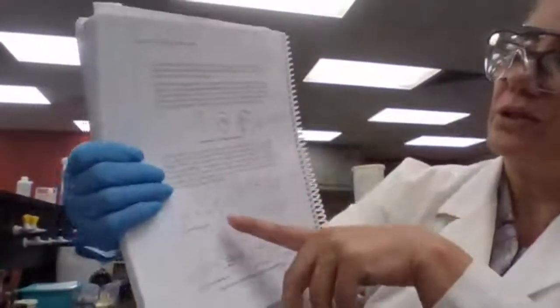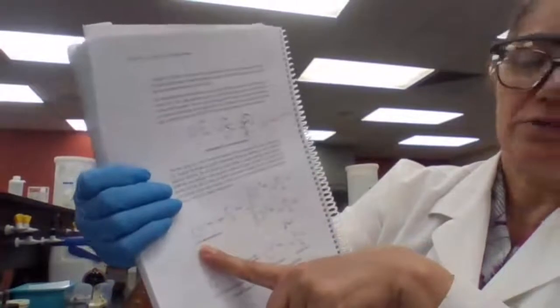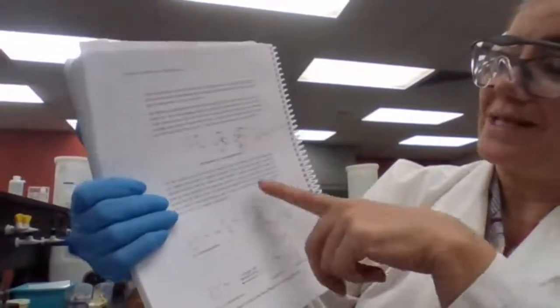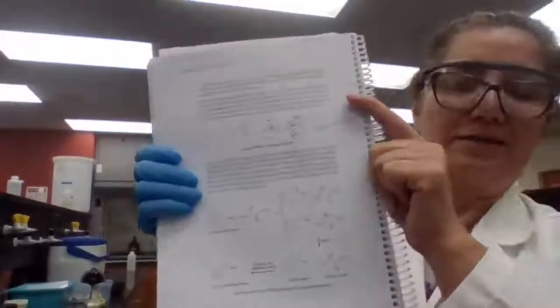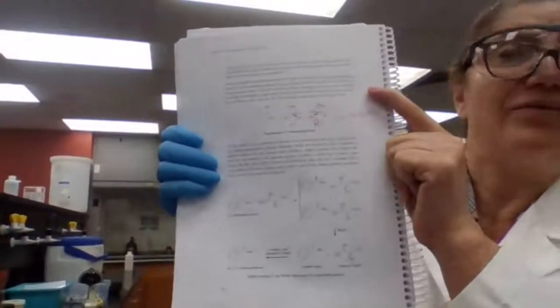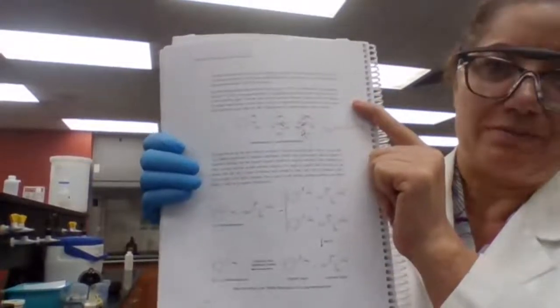So what is resolution? Resolution is you change the enantiomers first to diastereomers. When you change them to diastereomers, they have different physical properties. Diastereomers have different melting point, different boiling point, different refractive index. Enantiomers have the same physical properties, so they're hard to separate by physical means.